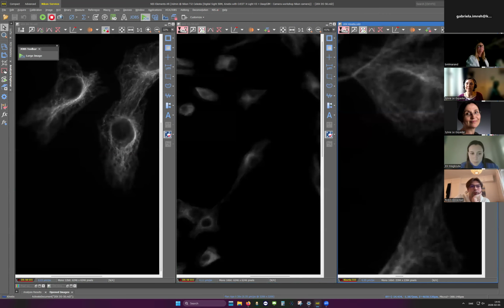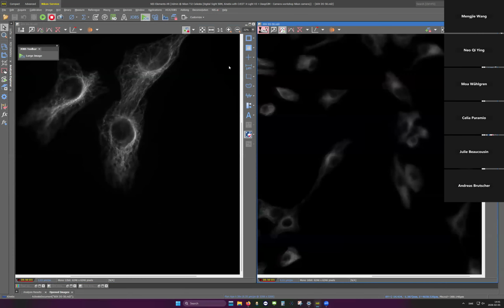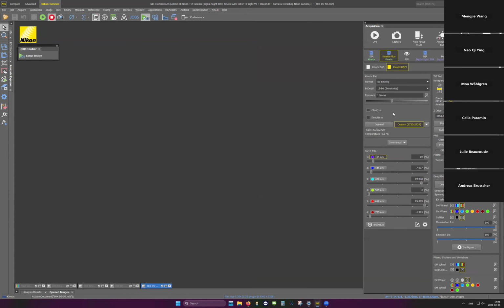I just wanted to say that when you zoomed out before, you were at the same place for both 20x's. It's not possible. Okay, we can check that later, but maybe that cell was there somewhere, but it was not in the image. So I will add this 1.5 extra magnification now. We are in the 20x now, and the 20x objective.